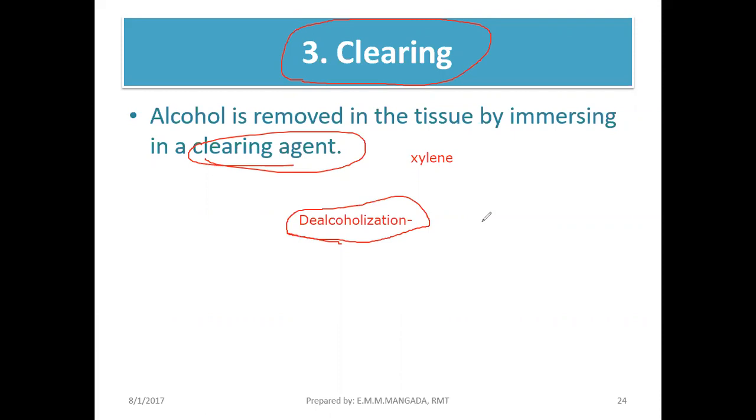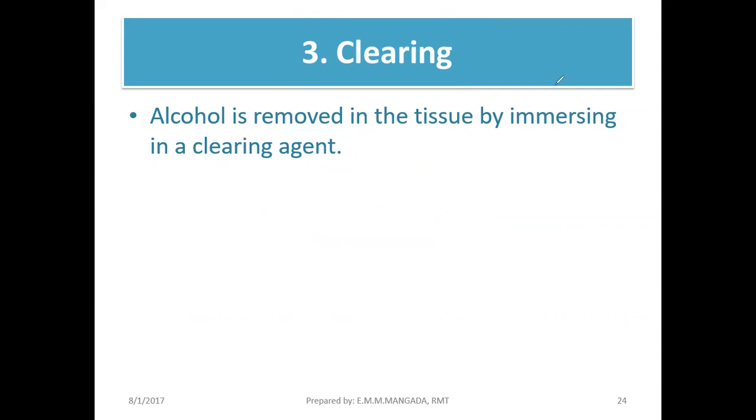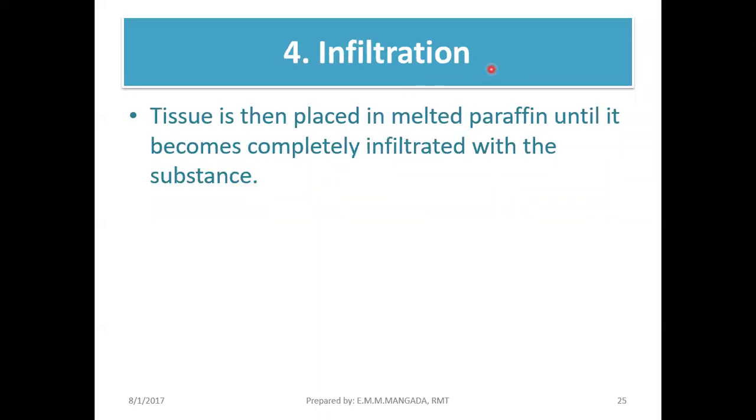But again, it's more known kasi, itong step na to or itong procedure na to, mas kilala sa term na clearing. But again, it's actually your dealcoholization. Again, the purpose is to remove the alcohol from the tissue. And saan galing yung alcohol natin? Galing siya dun sa dehydration process natin. So the most commonly used clearing agent, it's your xylene. So next, we have your infiltration.